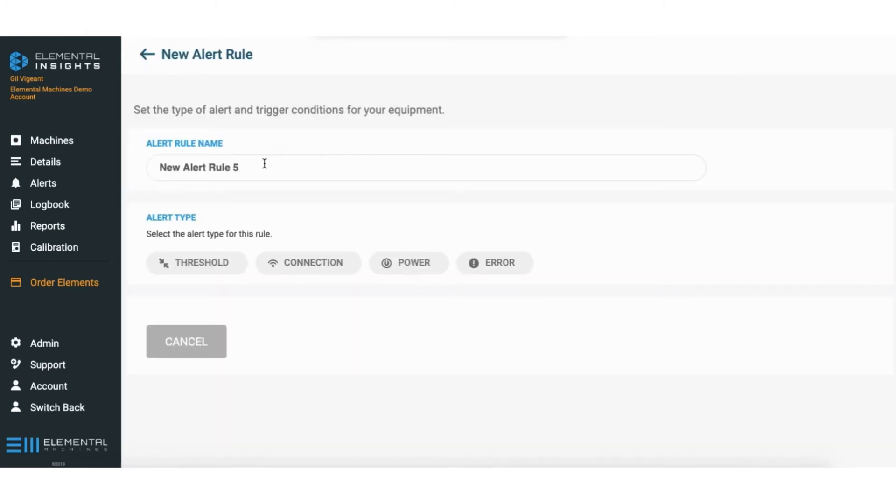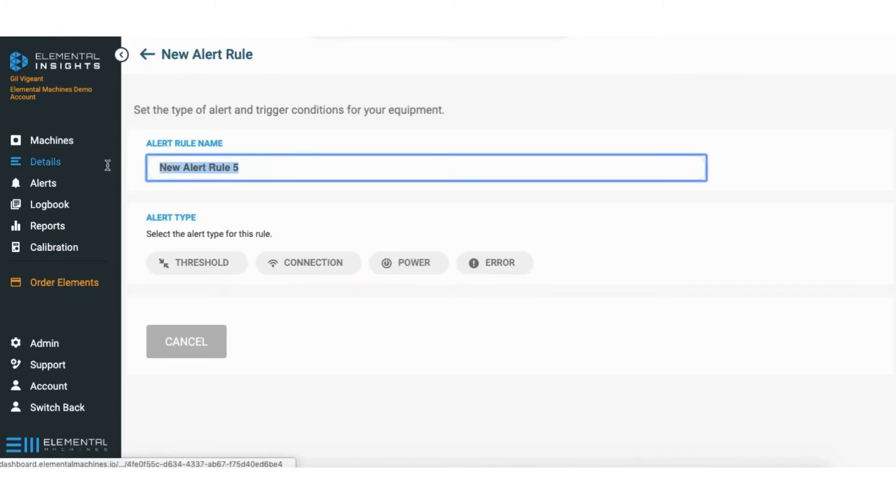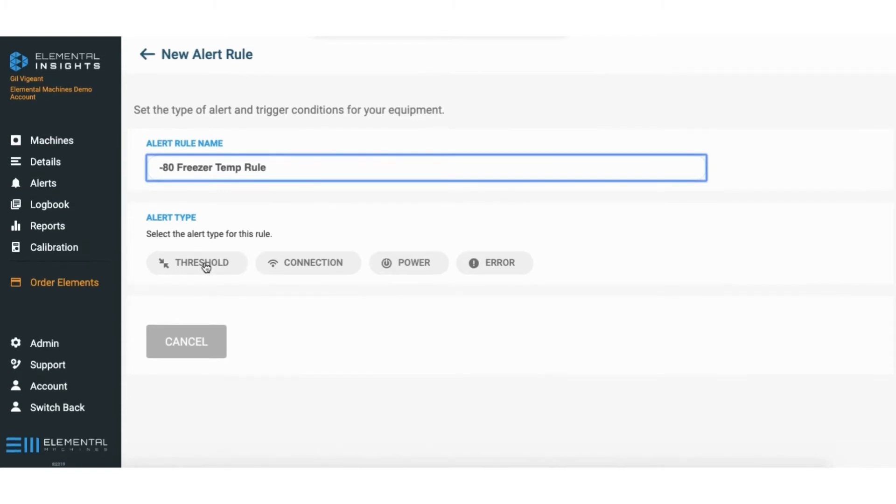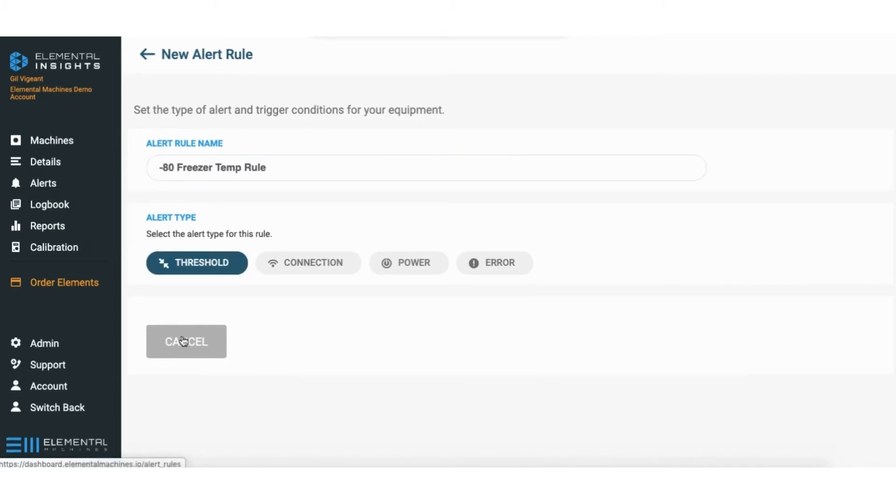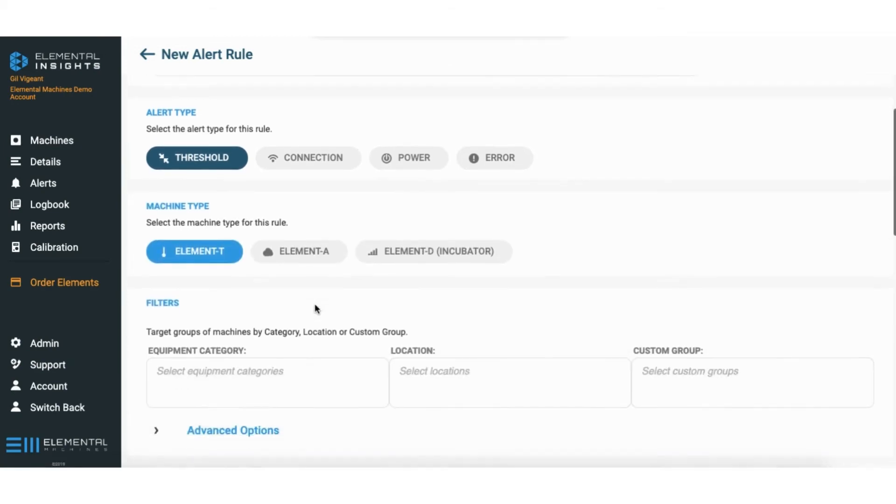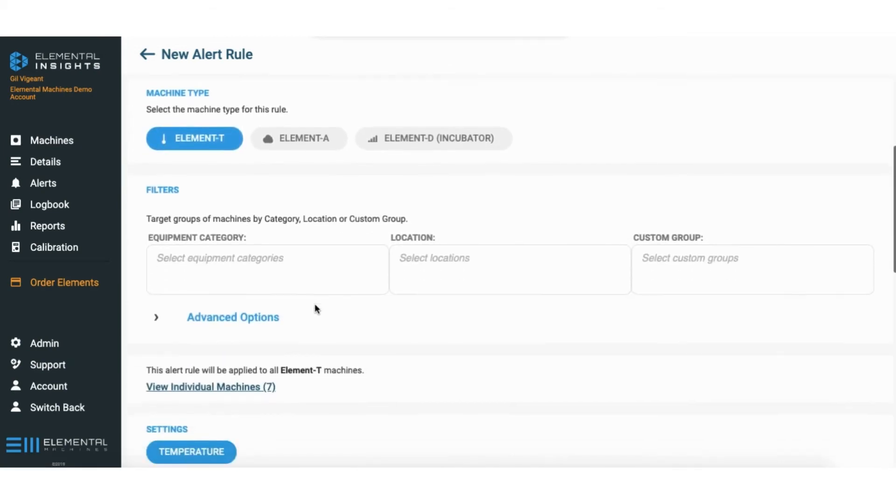From here I want to put in the name. This is going to be my minus 80 freezer temp rule. Going down we're going to click threshold and element T. This could go to any type of equipment you have.